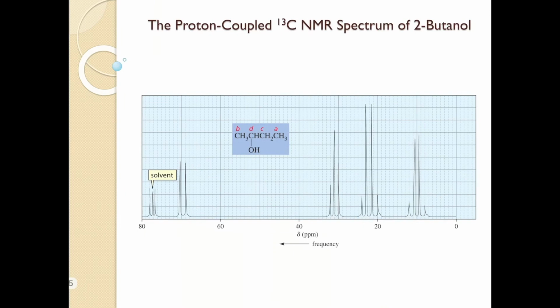Now, usually the carbon-13 NMR spectrum is run in the proton decoupled mode. If it is run in the proton coupled mode, you will see additional splitting patterns. This methyl carbon, because it is attached to 3 hydrogens, is going to be split as a quartet. The number of hydrogens directly attached to the carbon, 3 plus 1, gives a quartet, which you can see right here.